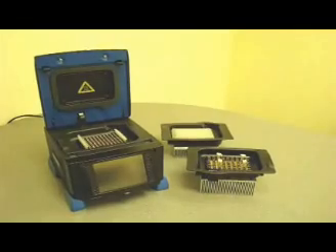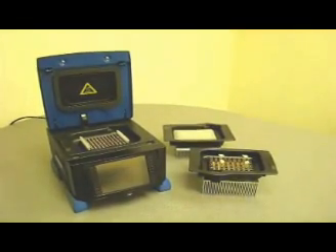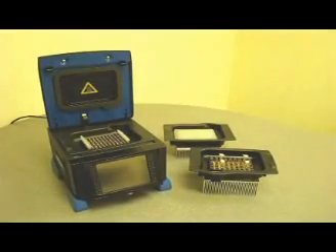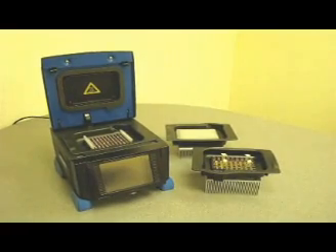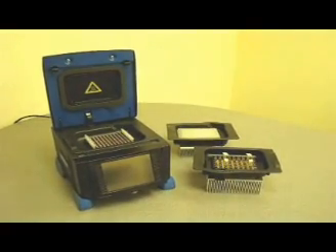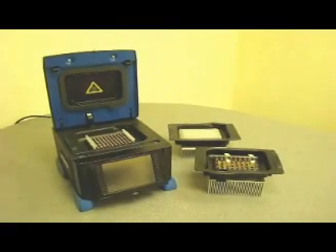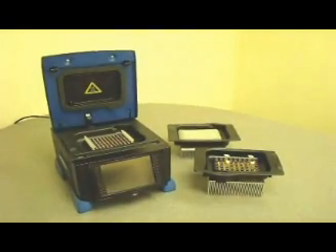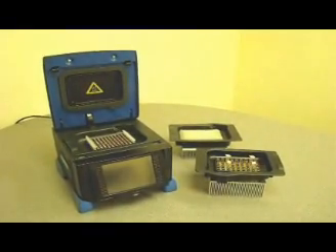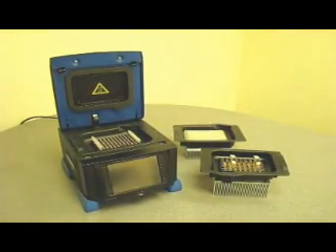So the real question is, which of the Amplitronics cyclers is right for you? The A6 offers maximum flexibility — with multiple blocks, it holds all types of tubes, plates, and slides. It features the widest gradient programming of any cycler on the market, and has twice the programmed storage and more features than the A4. If you don't need gradient programming and you only use tubes, then the A4 is the workhorse for you.